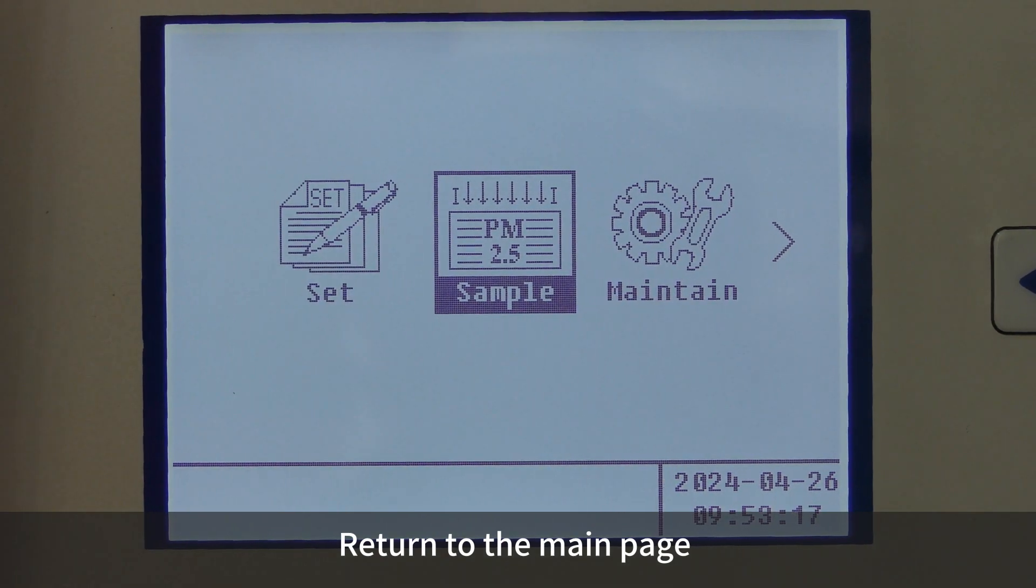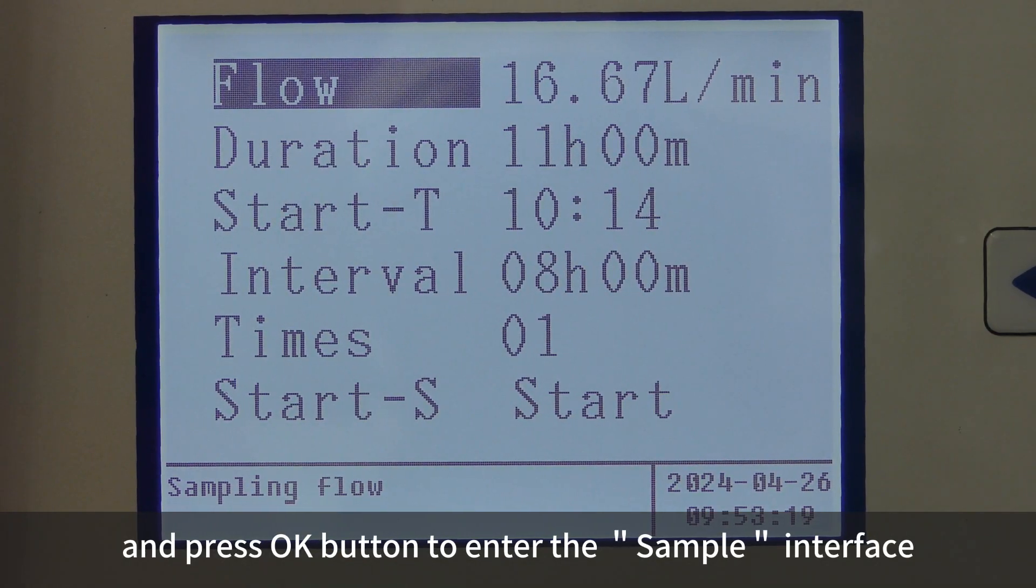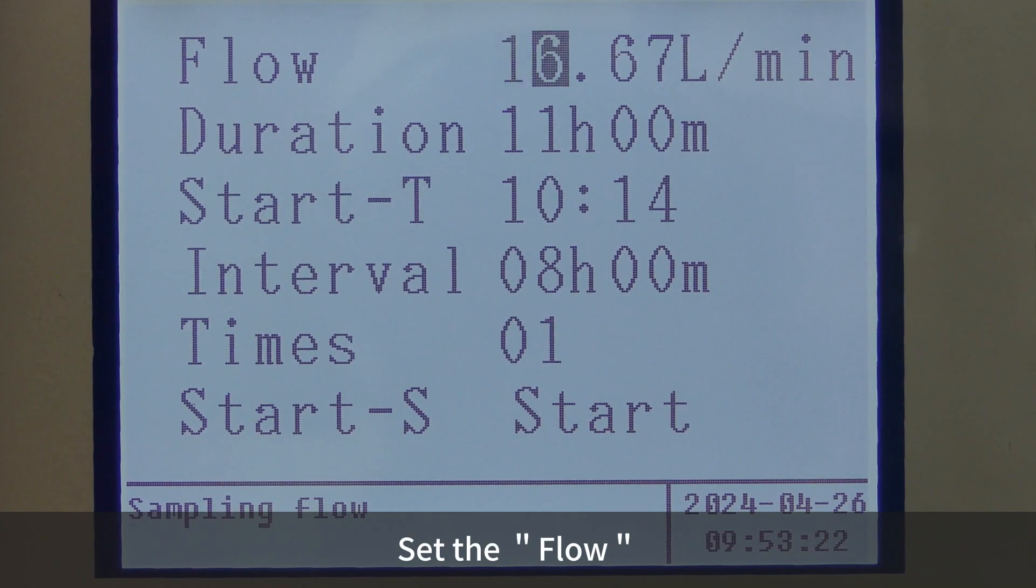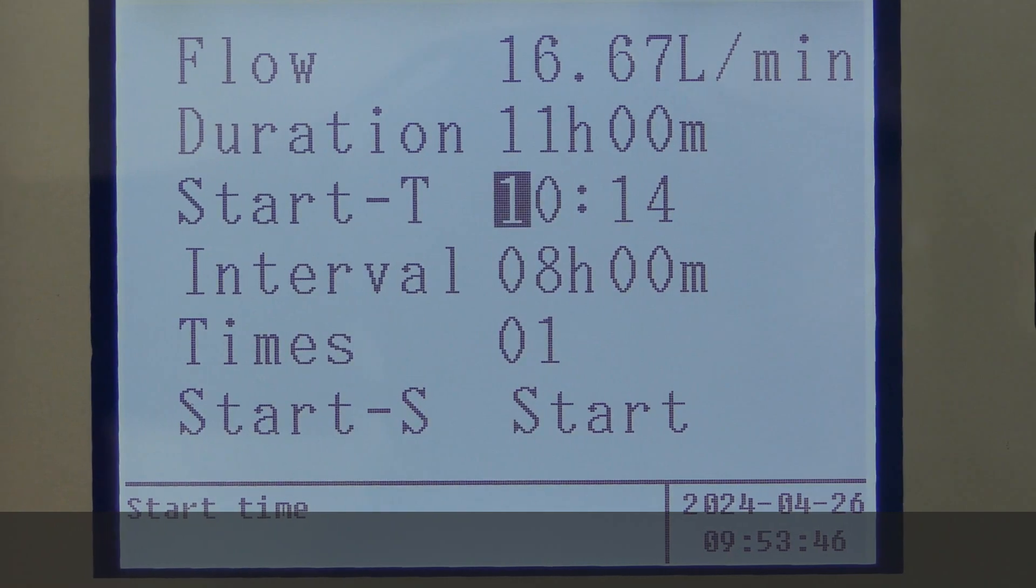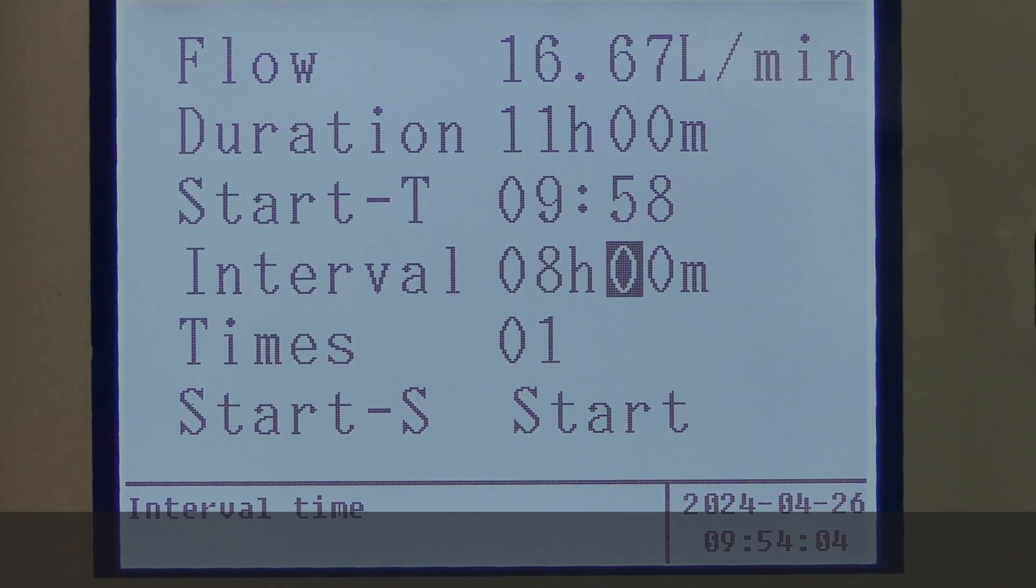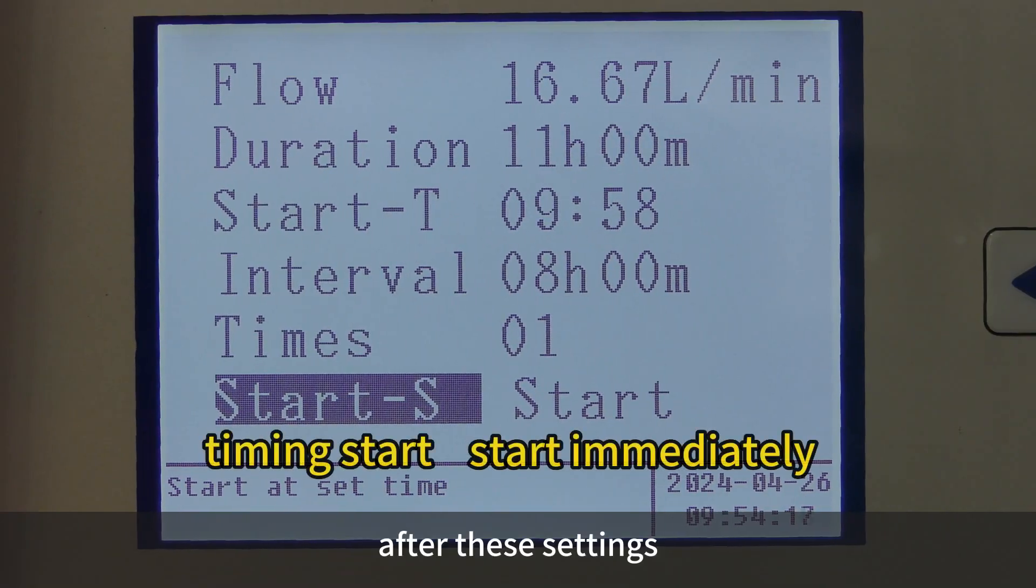Return to the main page and press OK button to enter the sample interface. Set the flow, duration, start time, interval, and times. After these settings, you can select Start S or Start mode.